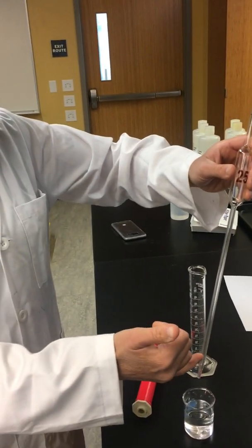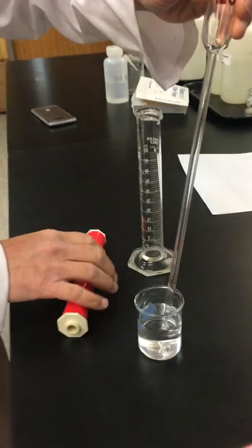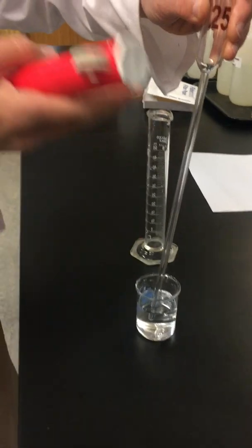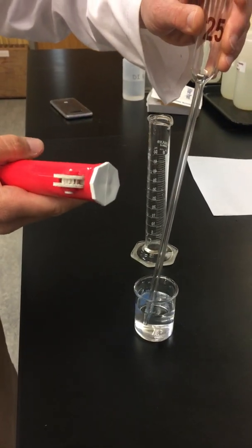Now we want to make sure the tip of the volumetric pipette is submerged in the liquid. Otherwise, when you start to pull up the liquid, you start to get splattering and air bubbles, and we want to avoid that.